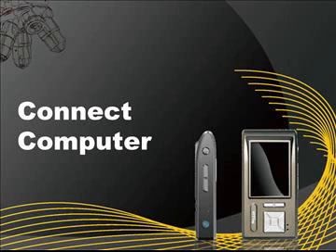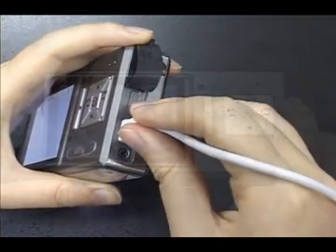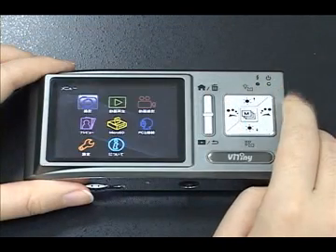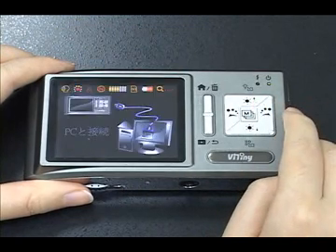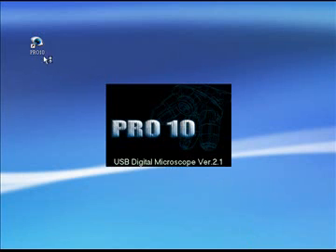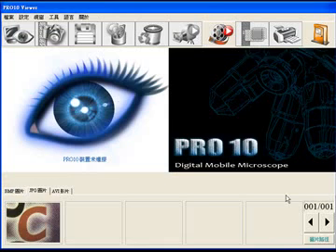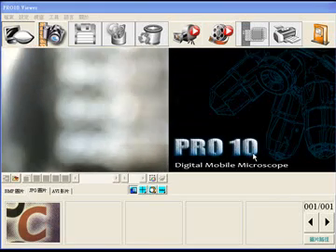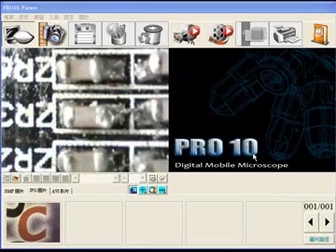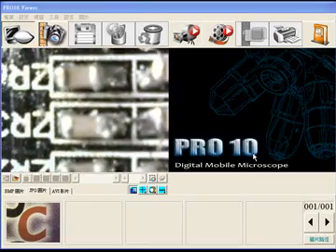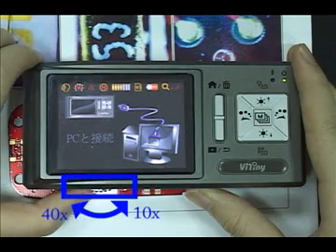Connect to Computer: plug in the USB cable, enter the Menu, choose PC Cam, and press the middle button — the device connects to PC. You can adjust magnification under PC Cam mode. At the moment, the effective magnification is optical 10 times and 40 times only.